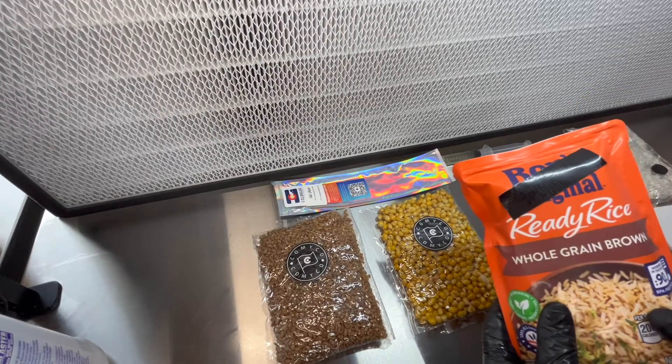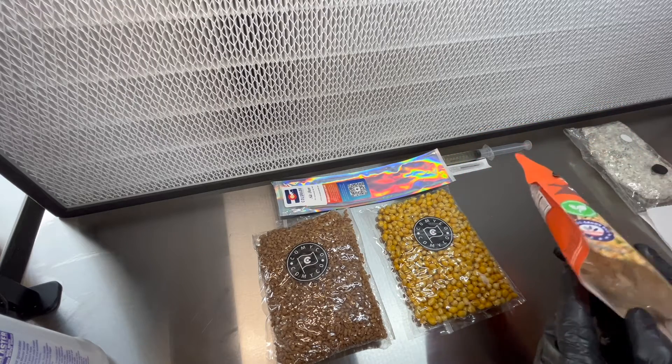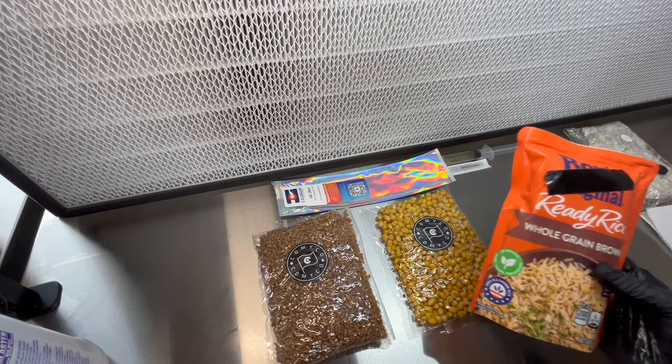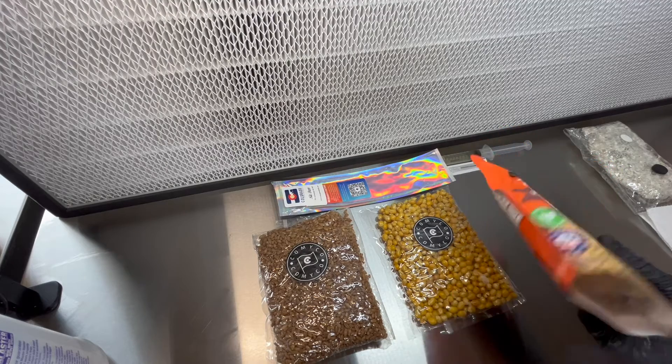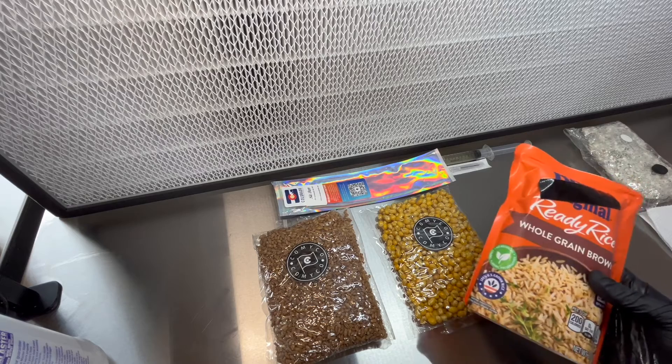So we got the Uncle Ben's. It's very accessible. It's sterile grain — exactly what you need in that sense. You can go to Walmart, you can go to the dollar store, you can find something just like this. So the convenience factor is pretty hard to beat.